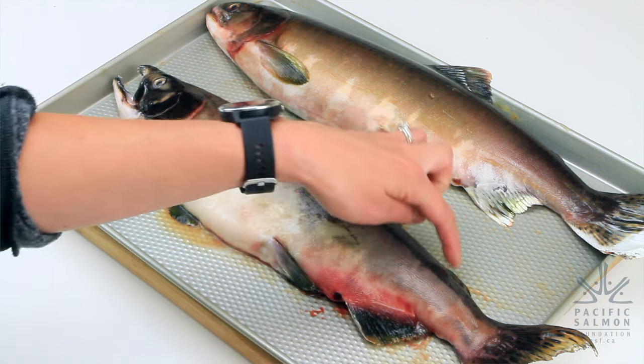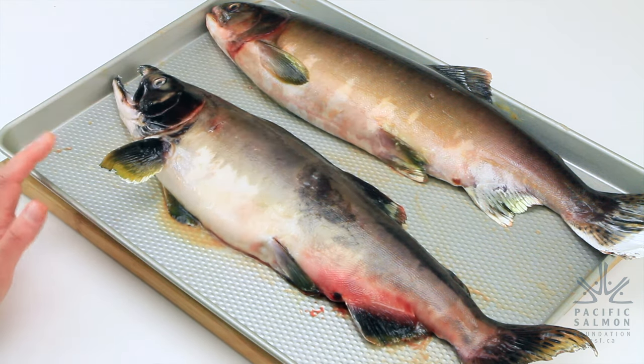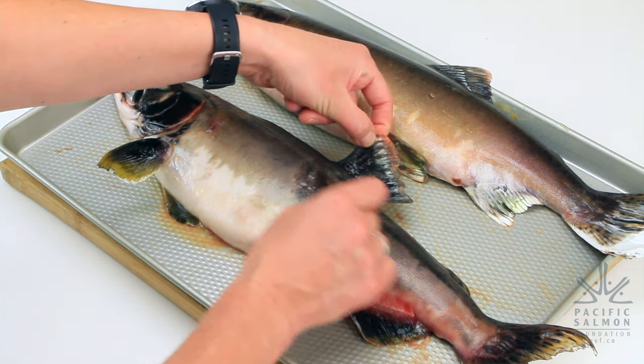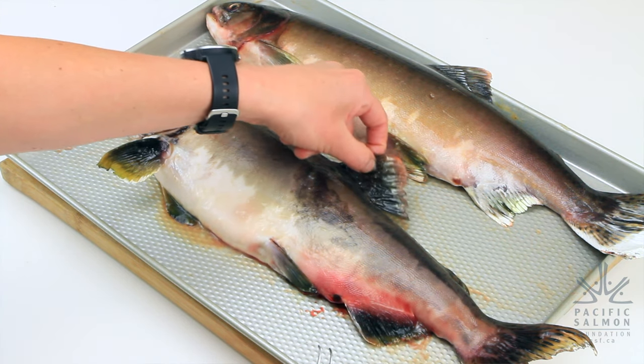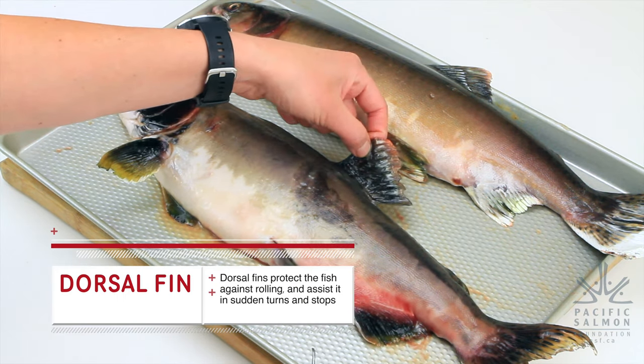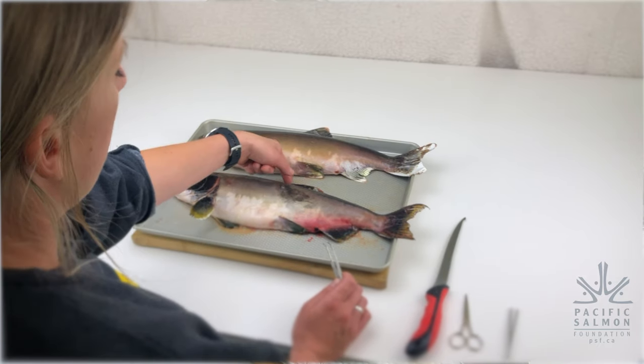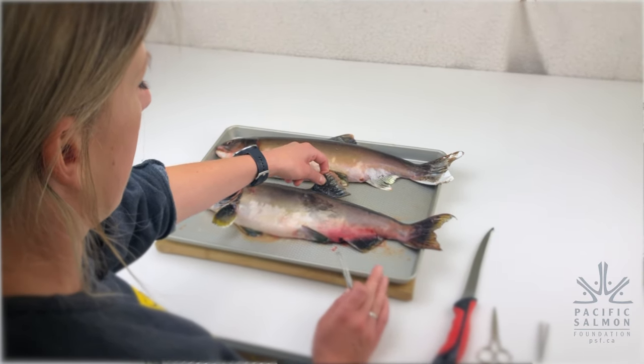Next we'll look at the fins of the salmon. There are a number of different fins, and in general the main purpose of the fins is to stabilize and propel the fish — it's what helps them move, swim, and turn in the water. The first fin is on the top of the fish, called the dorsal fin. It's really used to help stabilize the fish and also helps if the fish wants to make any kind of sudden turns.